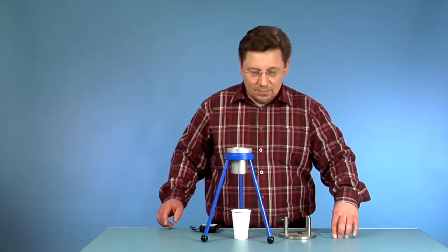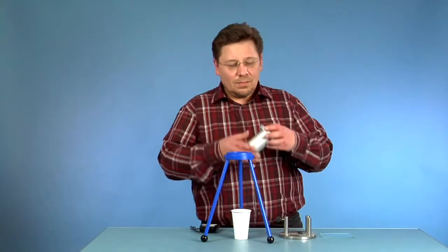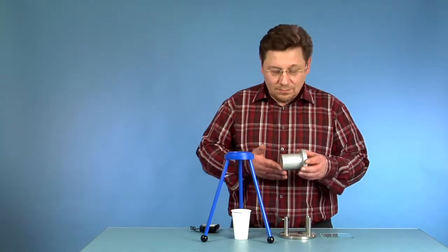There are several different types of flow cups available due to the different viscosities of liquid coating materials to be measured.